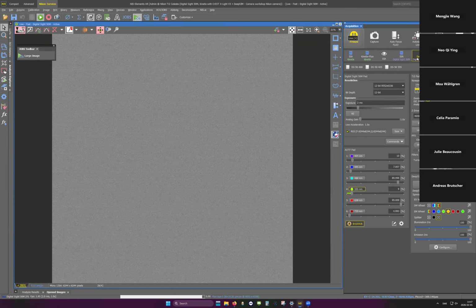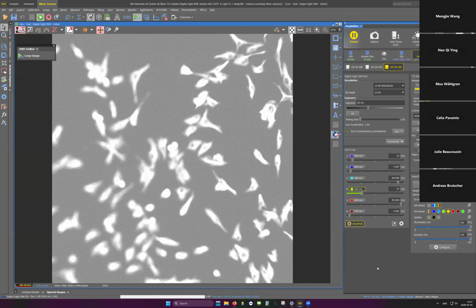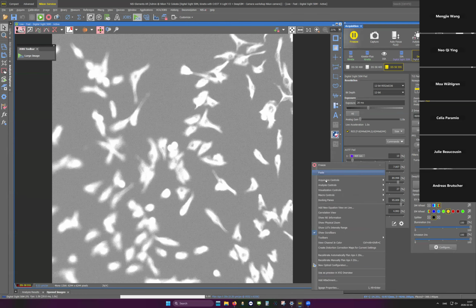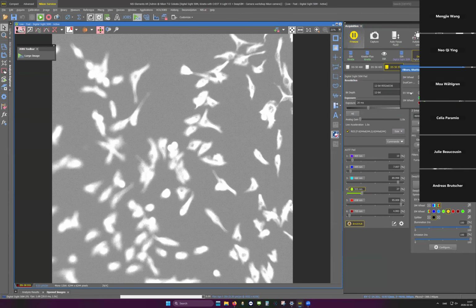Yeah, I was just thinking maybe I can do it with the 50M camera, so I'm just going to go for the 555 instead. See if that is listening to my wishes regarding the voice. So in some of your systems, I think you also have this extra magnification lens. With some manufacturers, it comes by default with the microscope, and for others, it's an option. So you basically have to buy it.